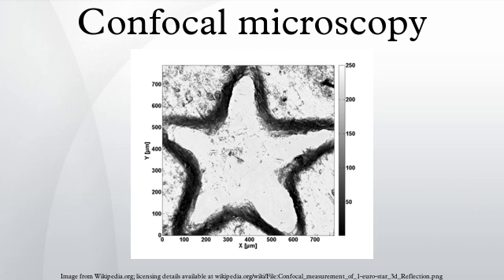The achievable thickness of the focal plane is defined mostly by the wavelength of the used light divided by the numerical aperture of the objective lens, but also by the optical properties of the specimen. The thin optical sectioning possible makes these types of microscopes particularly good at 3D imaging and surface profiling of samples. Techniques used for horizontal scanning.